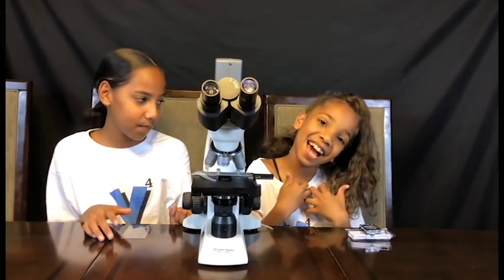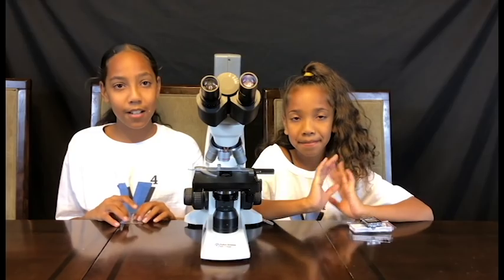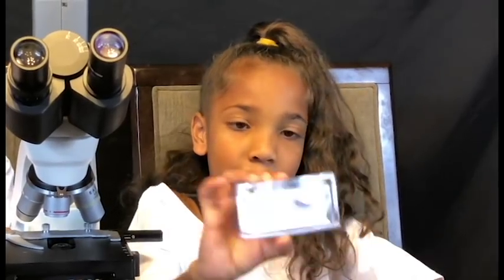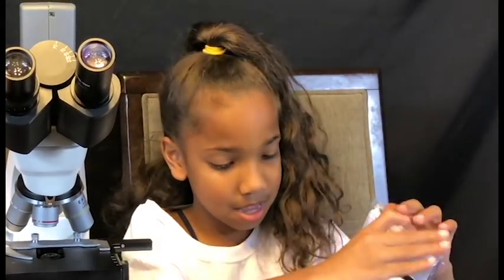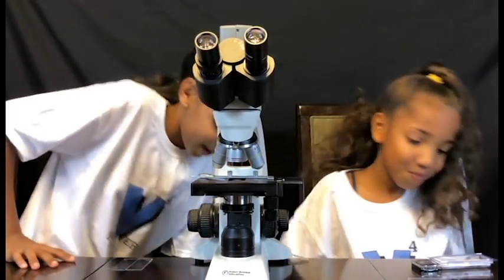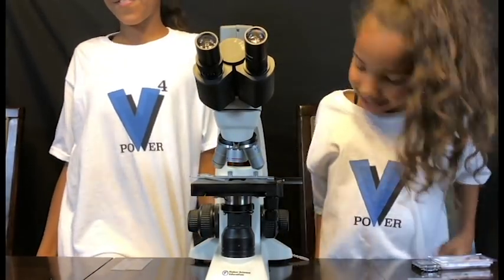Hey guys, it's Jasmine and Janiyah, and today we're gonna be doing another episode of how does it look like underneath a microscope. I'm gonna be looking at some nail polish and some lip gloss, and I'll be looking at fake eyelashes and face glitter. So let's get started, and by the way, look at our new shirts!